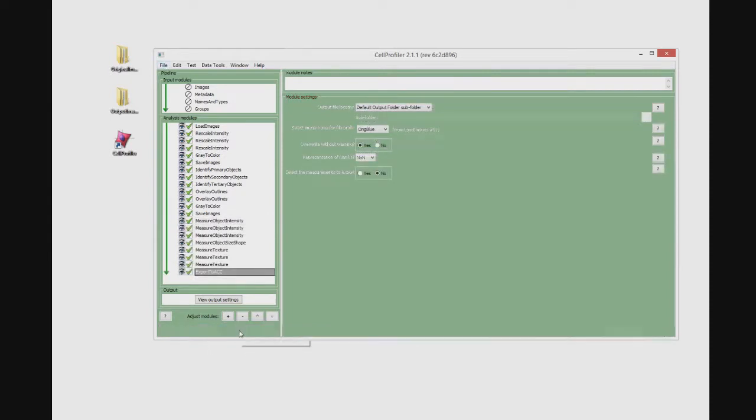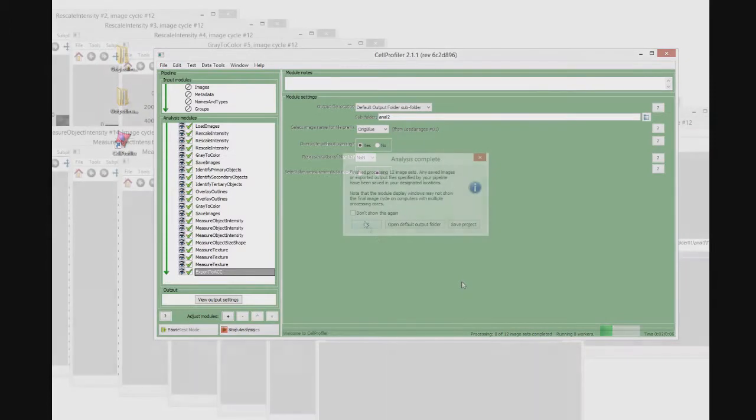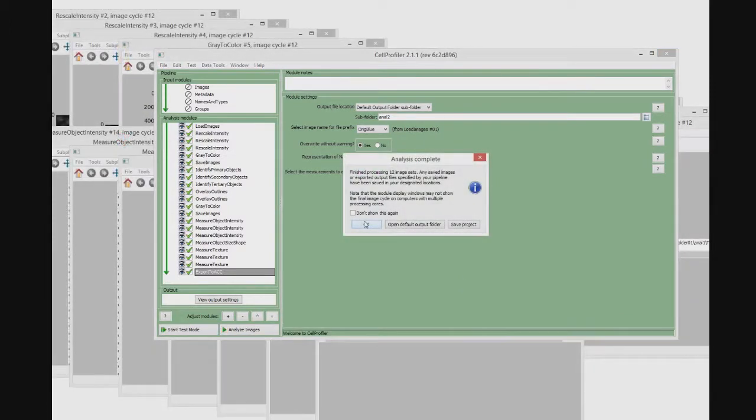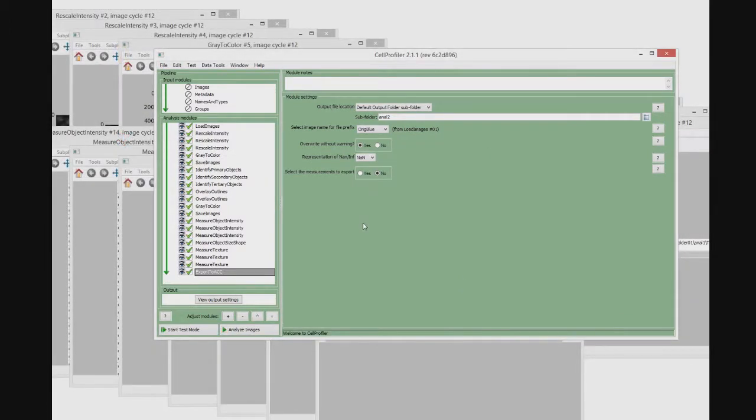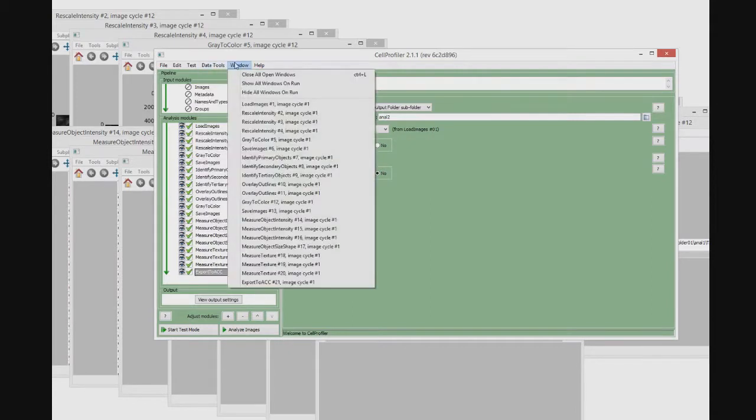To make this module working, save the file in the plugins folder of Cell Profiler. Finally, simply run the Cell Profiler pipeline just created to obtain all the files needed by Advanced Cell Classifier.